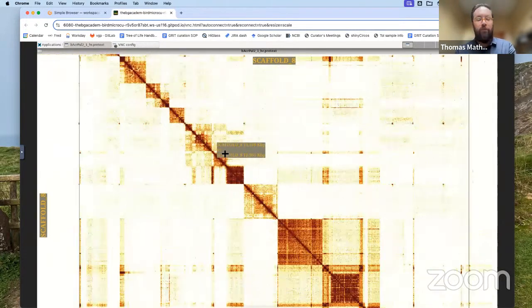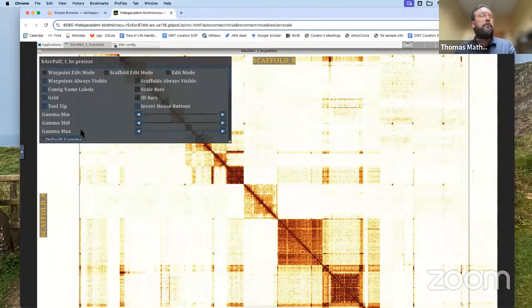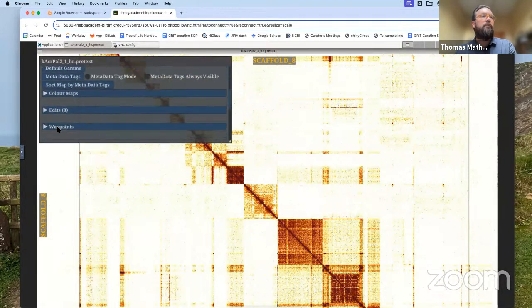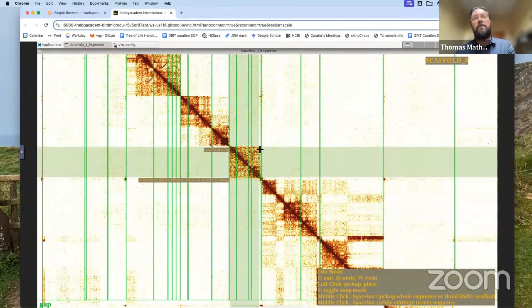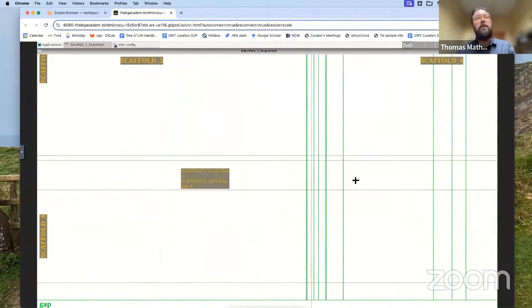So here, if we zoom in, we put the gaps on. Here you can see there's these drop-off points in Hi-C contacts actually correspond to gaps in the assembly as well. So, for example, here this looks like one individual microchromosome on its own. If you look along the assembly, it's not hitting any of the other large chromosomes.